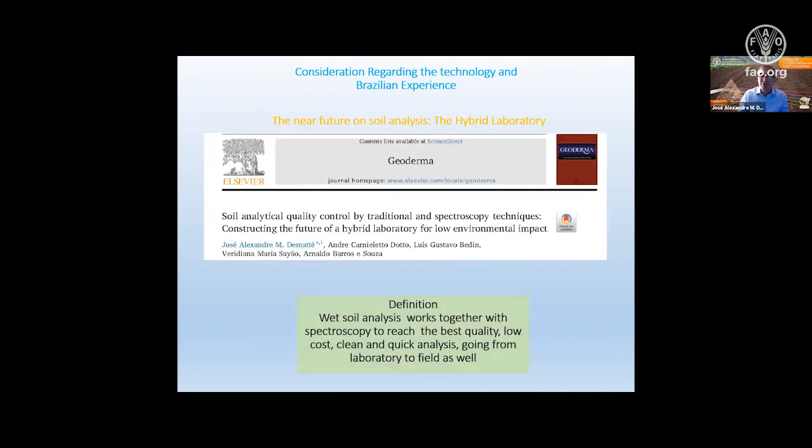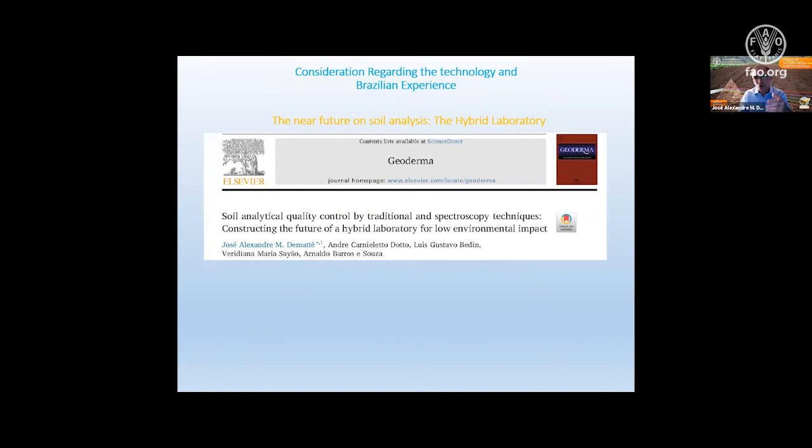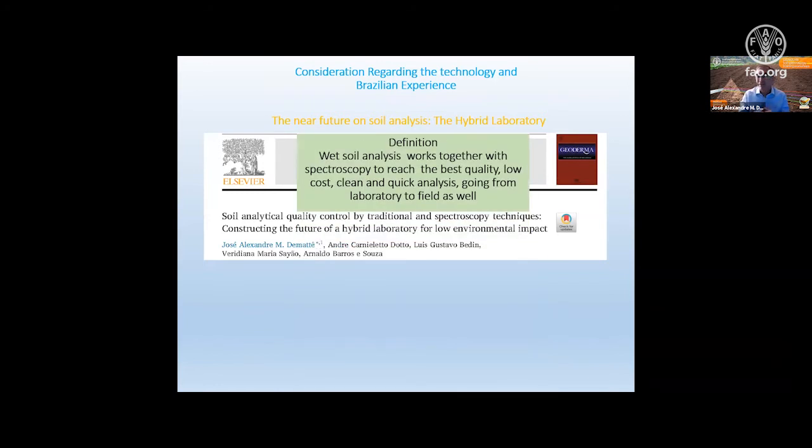So the hybrid laboratory that started to show in this paper here, the definition is that wet soil analysis will work together with spectroscopy to reach the best quality, low cost, clean and quick analysis, going from the laboratory, and you can go to the field as well.